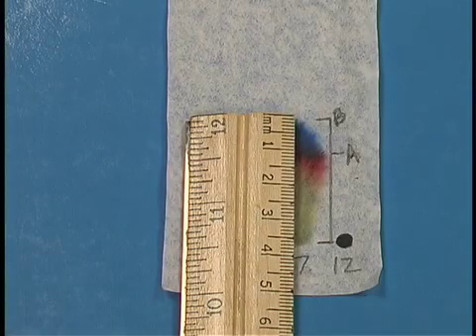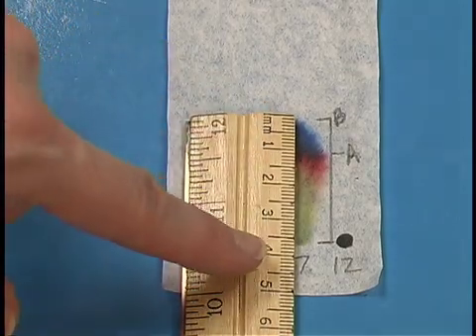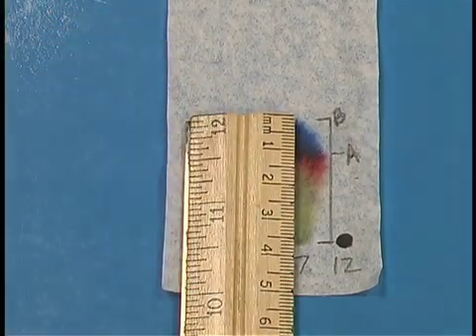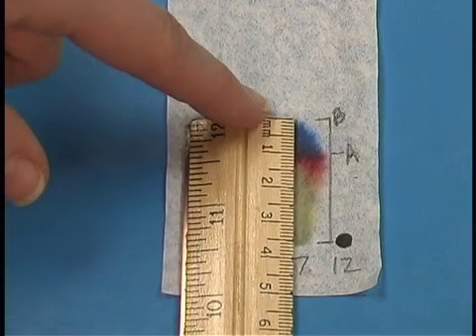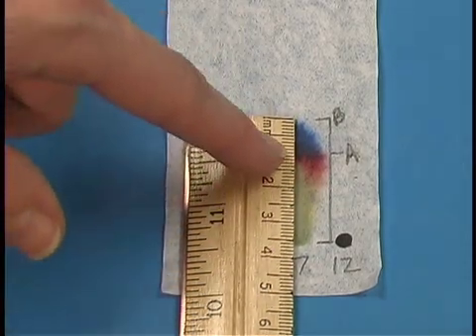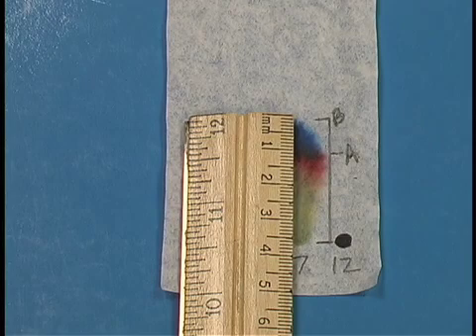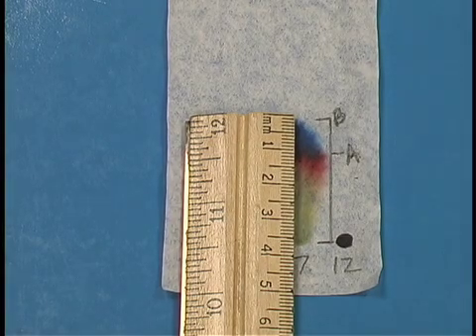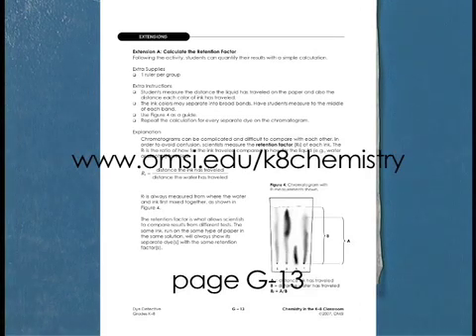Extension A has an experiment where you can measure the RF value — it's a retention factor value — for the ink. It compares the total distance the solvent traveled compared to how far a particular ink traveled. The distance that the water traveled is about 35 millimeters, and the distance that the red ink traveled is about 25 millimeters. To calculate the RF, you divide distance A by distance B. On page G13 in your book, you'll notice there is a typo — the diagram is mislabeled with A and B switched. If you go to the website, you'll be able to download new pages so that the diagram is correct.